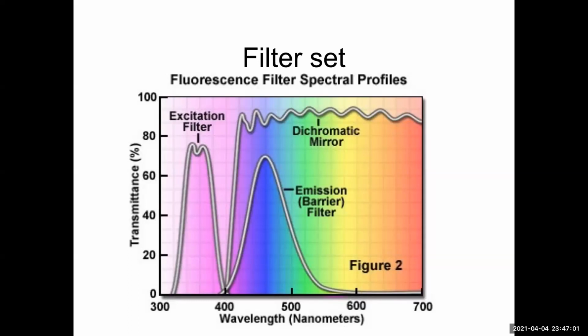And getting to the perfect system hasn't happened yet, and probably won't ever, because again, this is real life. This is good to know, to analyze your data, to understand why things are very different from one scope to another, where you might not see something on one scope and then see it on another because it's set up differently.